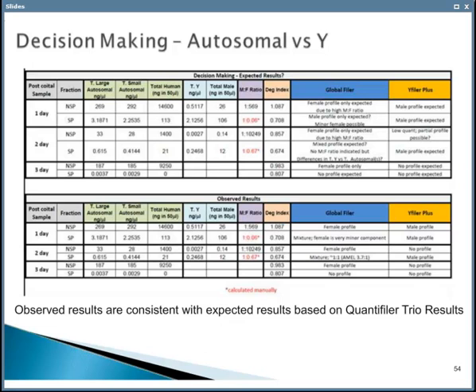And what did we find? If you go down to the second table, you see a mixture. Female is a very minor component. With GlobalFiler and with Yfiler Plus, we found a male profile. If you then go to the 2 days, we do the same thing.